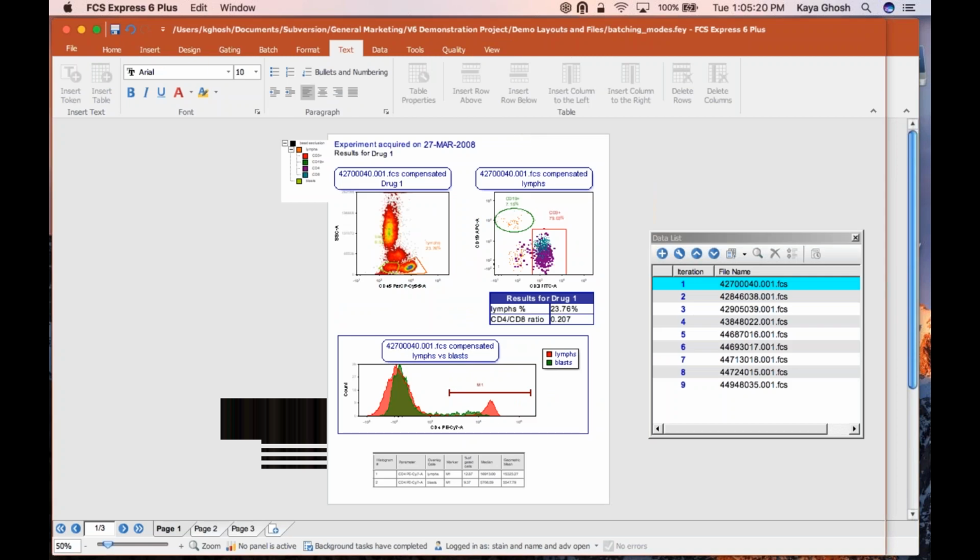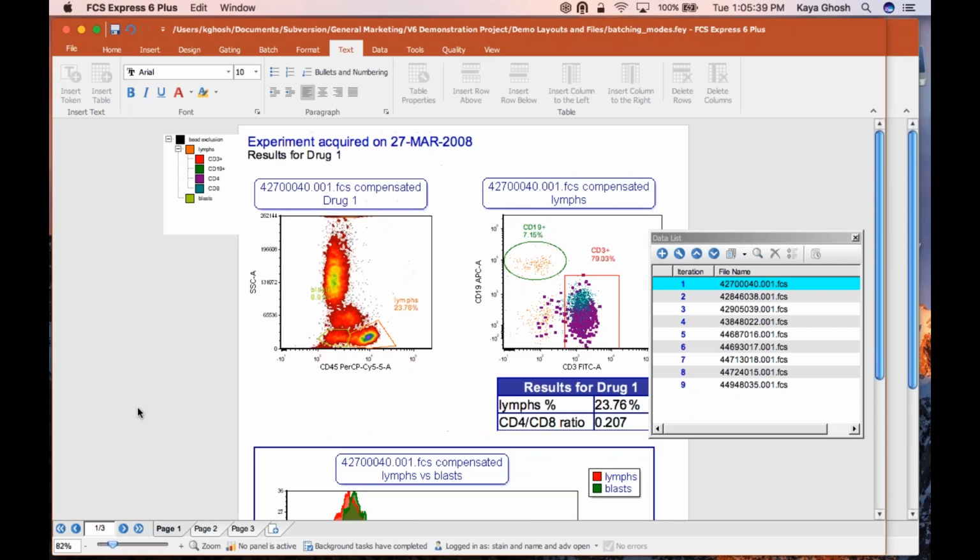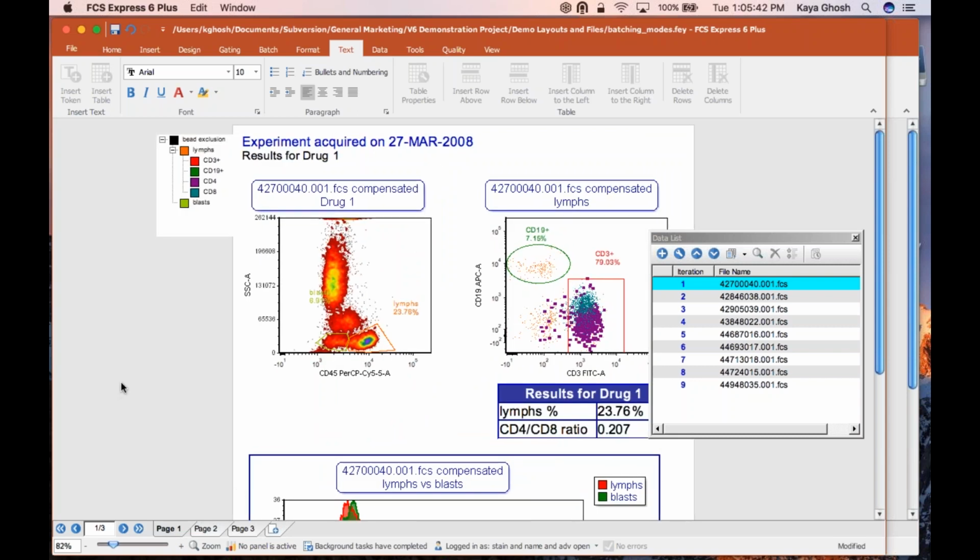So the first thing I want to do is just introduce you to this layout. It is a 3-page layout. You can see the page tabs here at the bottom. Okay, we have 3 pages. So this is our first page, where maybe I'll zoom in a little. The details are really not so important, but just to give you an idea of the things you can do.